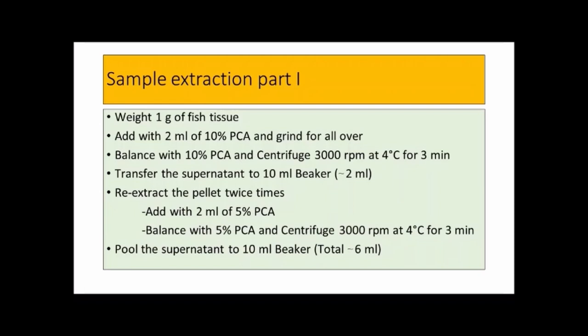Add 2 ml of 5% PCA and balance with 5% PCA. Centrifuge at 3,000 rpm again with the same conditions. Pull the supernatant to a 10 ml beaker, with a total volume of about 6 ml.